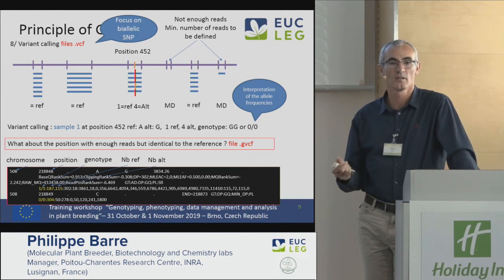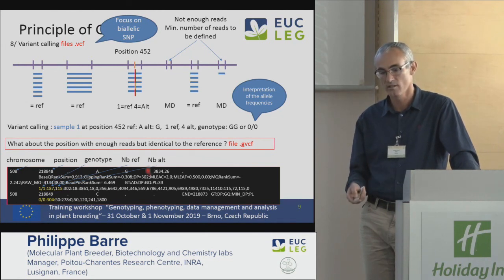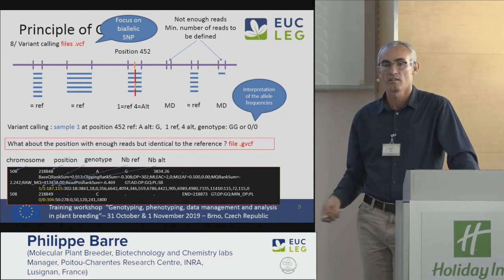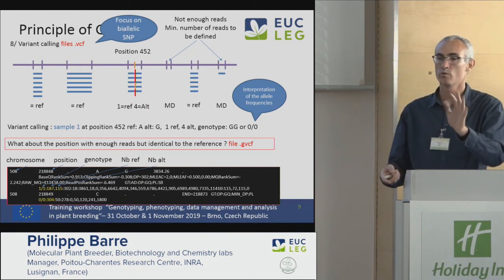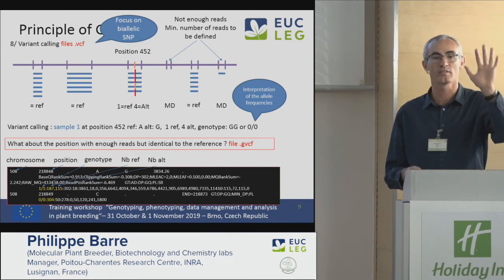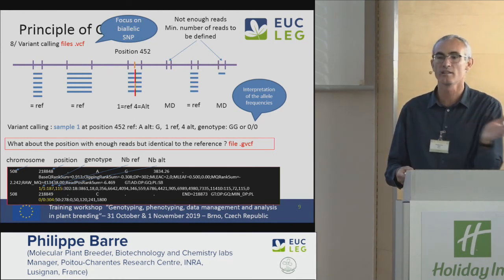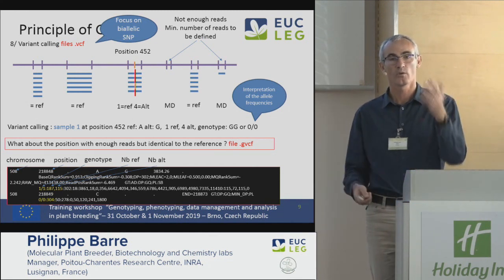I don't know. What is your... Because here it's really a decision that we have to make. We have some reads. For you, when you have 5 reads, who is going to call for SNP here with 5 reads in the assembly? I don't know if... So it's a diploid. You have 5.